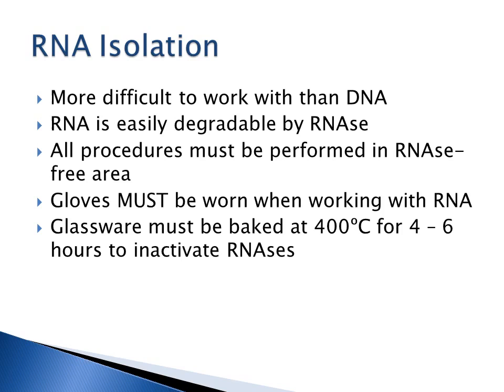You're always going to use RNase free tubes. You're going to use barrier pipettes, sterile pipettes. Everything has to be RNase free. You're going to buy special RNase free water. The kits that you would purchase for RNA extraction all are RNase free. So with RNA, you have to just be a lot more careful than when you're extracting DNA.